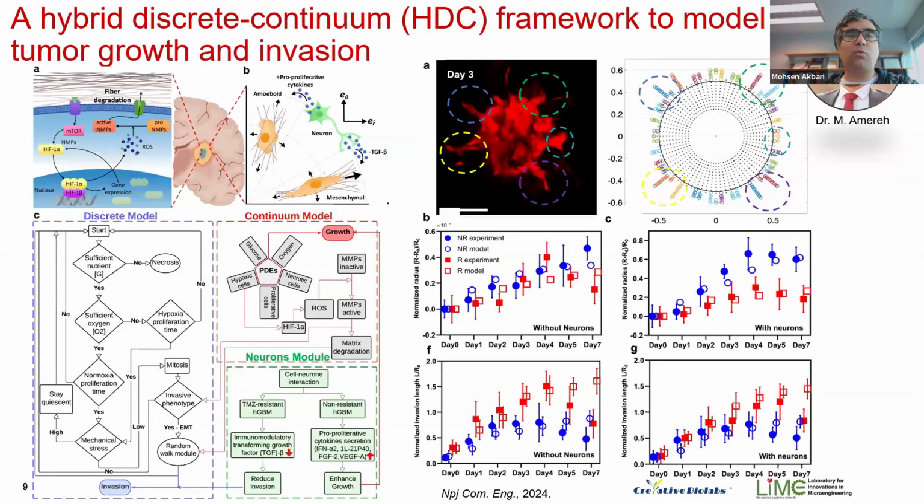We also wanted to further accelerate the process of investigating how tumors grow and then invade. For that reason, we developed a theoretical framework that predicts tumor remodeling and invasion, with the goal of optimizing the therapeutic strategies in silico before even going into in vitro studies.